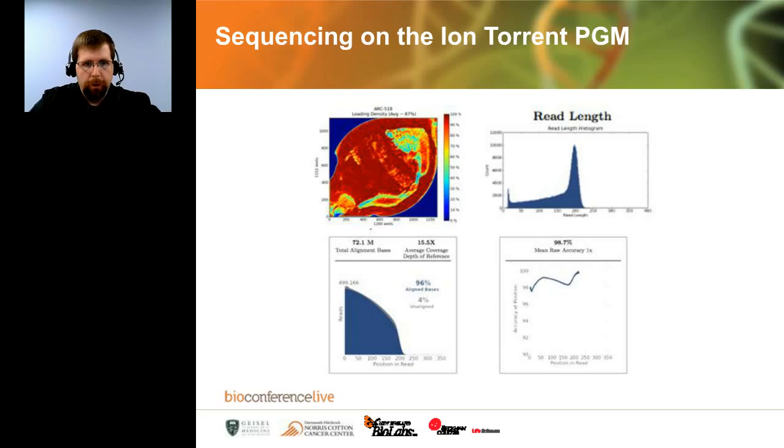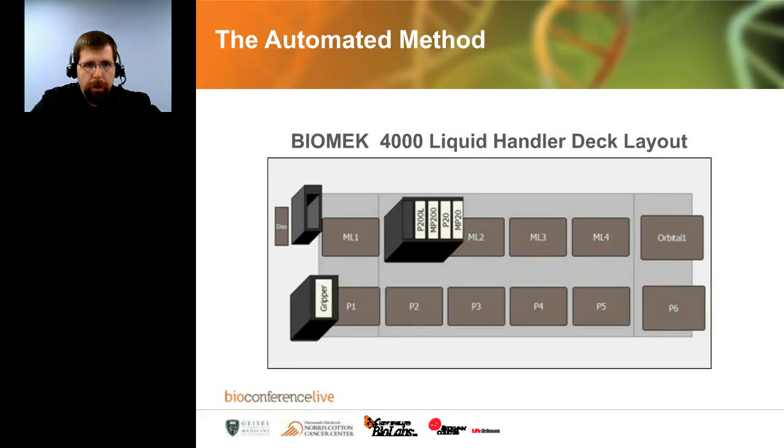Thank you, Lynn. So I am going to talk about some of the work that we performed here at Beckman Coulter to automate this protocol. The protocol in question was automated on our BioMek 4000 liquid handler, which is the smallest of our BioMek platforms, largely by Sarah Simons, one of our very capable field application scientists.